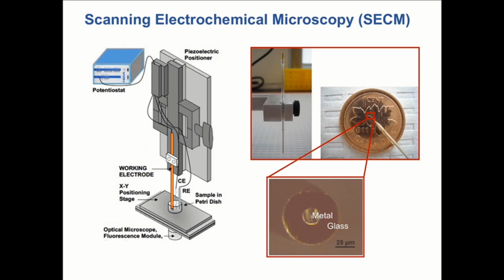All right, but what if it is not an efflux-dependent mechanism? To investigate these intracellular resistance mechanisms, we use the technique of scanning electrochemical microscopy. SECM is actually an incredible tool that lets us track how many molecules interact with a sample, such as a living cell, per second. Scanning electrochemical microscopy is a technique that was invented a couple of decades ago, but has increasingly received attention in the biological field over the last decade.